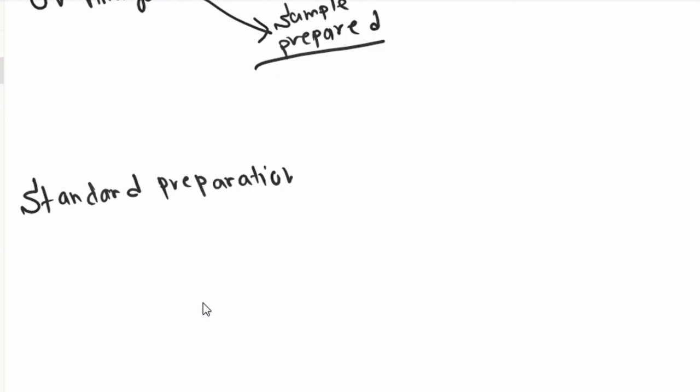In quality control, what you are doing is according to specification and certain rules. If you are working in the UK, there is the British Pharmacopoeia, and you need to follow those standard methods.